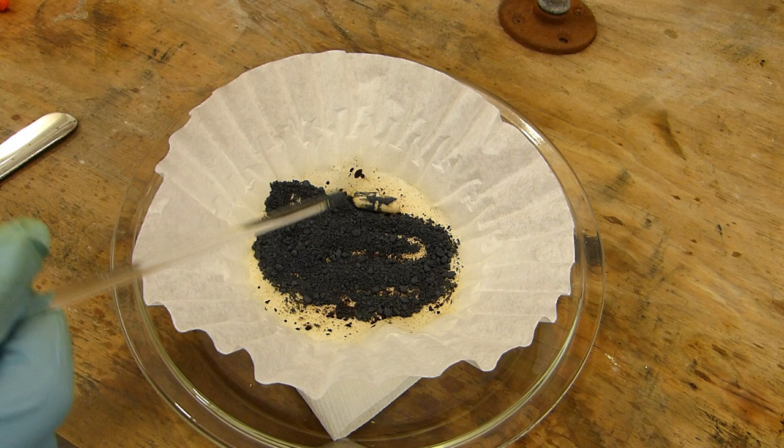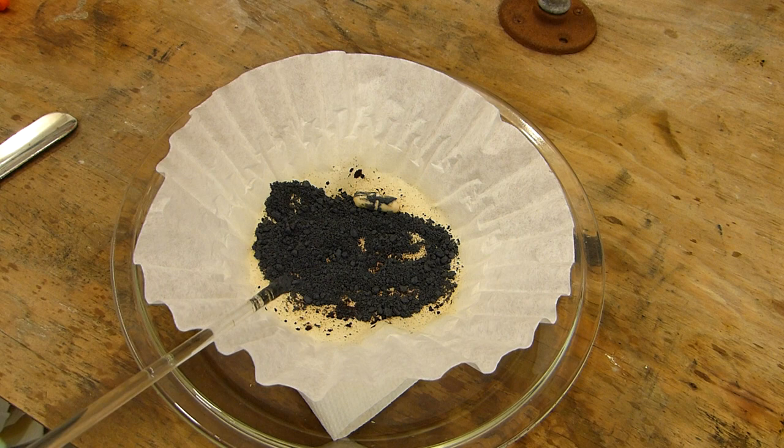I don't run many reactions that aren't tolerant to water that require iodine except maybe Grignards. And I need to purify the iodine beforehand with sublimation anyway.